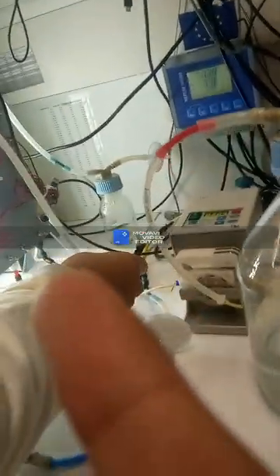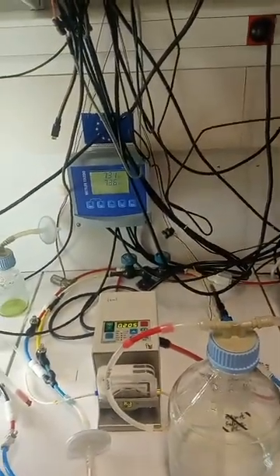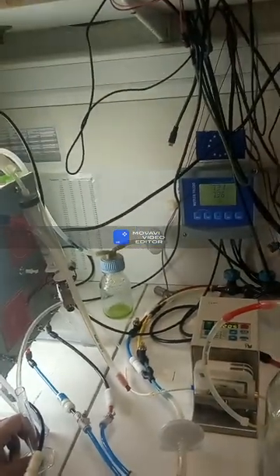It is not done at 0.205 initial. You have to plug this back. But did you put the chronometer? No. So you have to monitor the time, with a stopwatch. Just the time will be good.